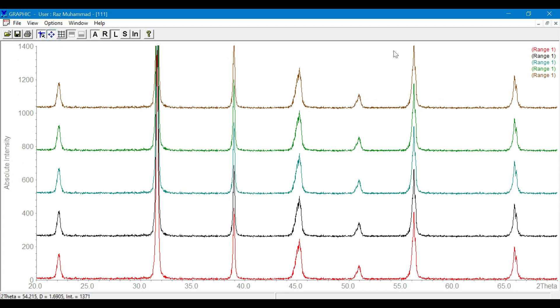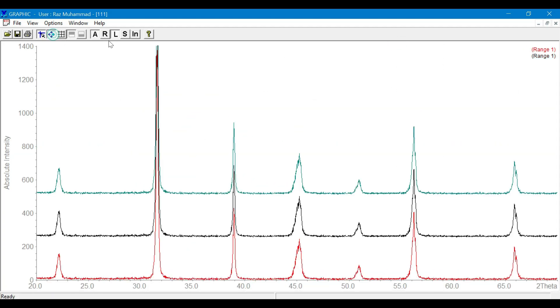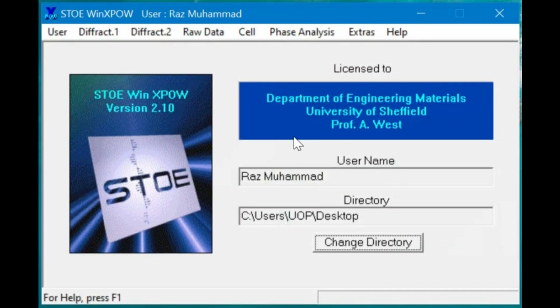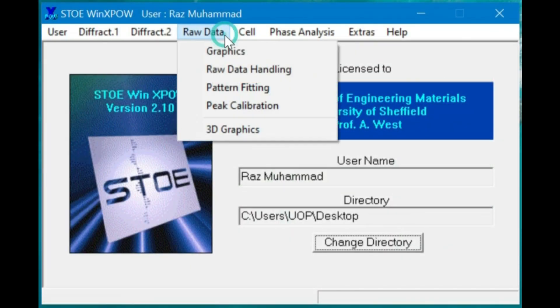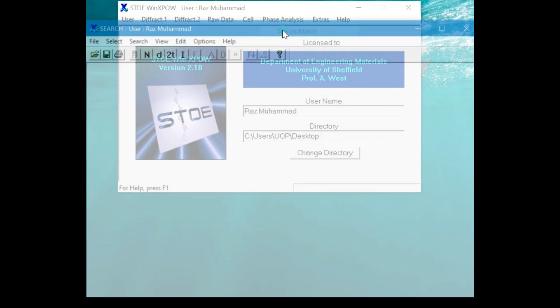For phase identification, you need to go to the phase analysis section and open your XRD data file.